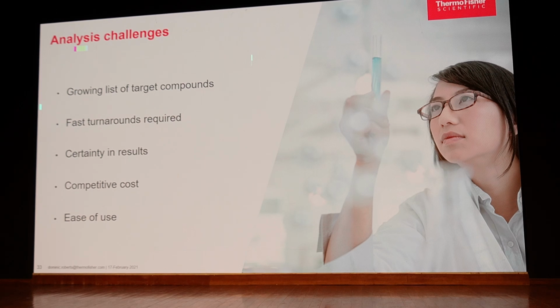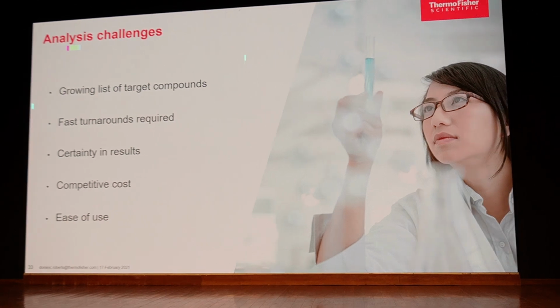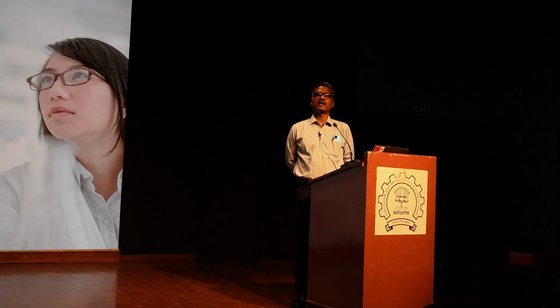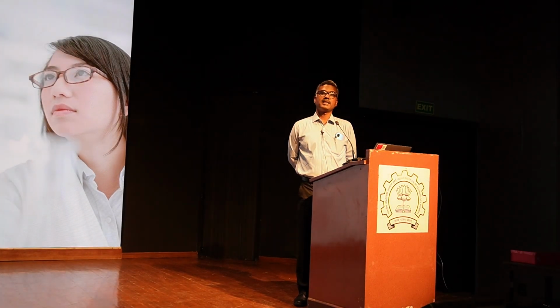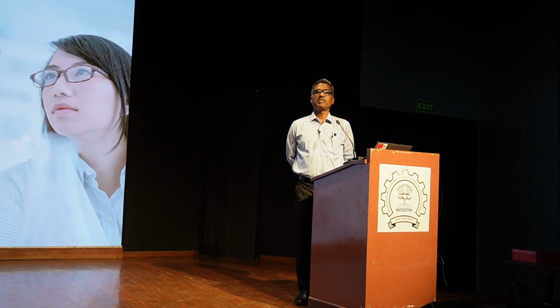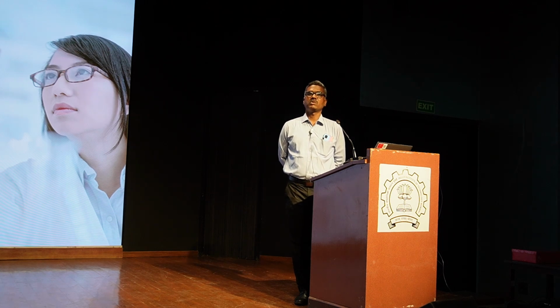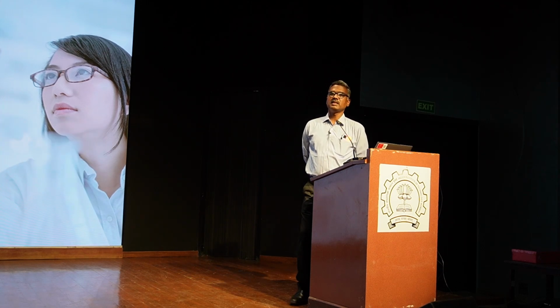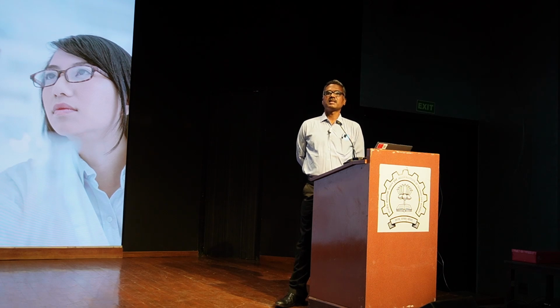Then, as part of this multi-residue analysis, you need to report the parent compound, and in certain cases their metabolites also. When you are doing the parent compound analysis, the metabolites may not be stable, or they may have challenges with respect to analysis and sample preparation. Those uncertainties also need to be considered when you are confirming that the method is fit for purpose.